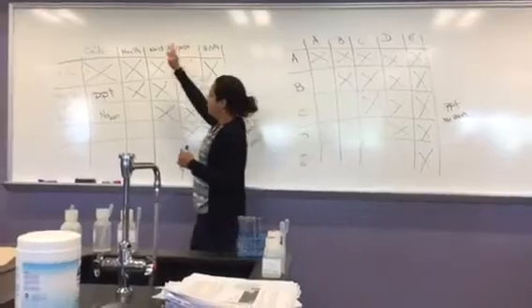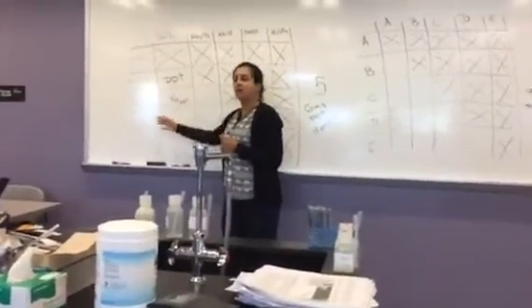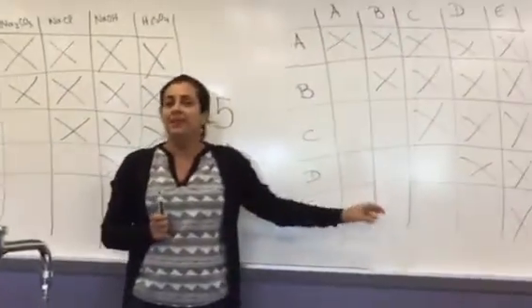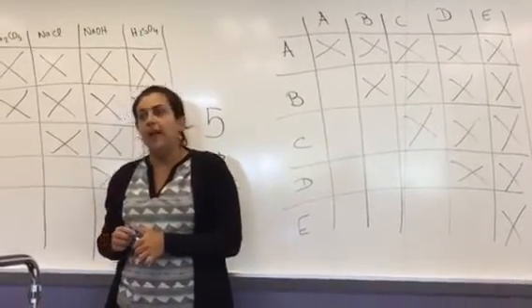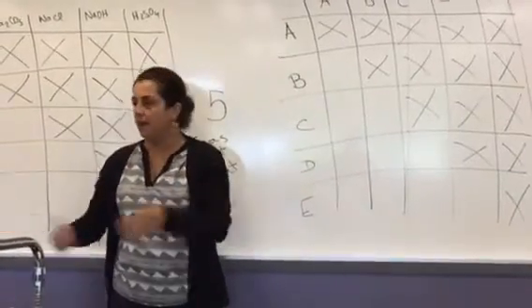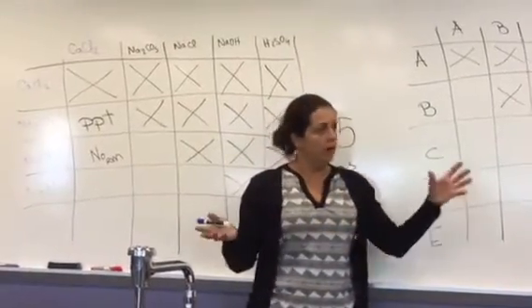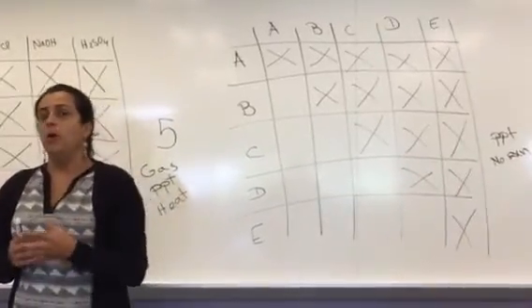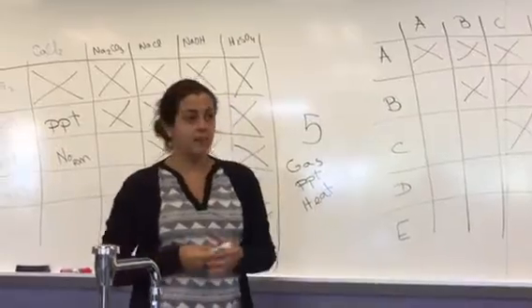Based on your results, you're gonna compare these to what you observed with the knowns. So for example, if calcium chloride behaves like this, it gives you a precipitate and no reaction, you will look among the unknowns for something that behaves the same way as calcium chloride. And then you will say, based on your conclusions, A is gonna be calcium chloride, or A is gonna be sodium chloride, or whatever. So your grade is gonna be based on how you got the identity of the unknowns.